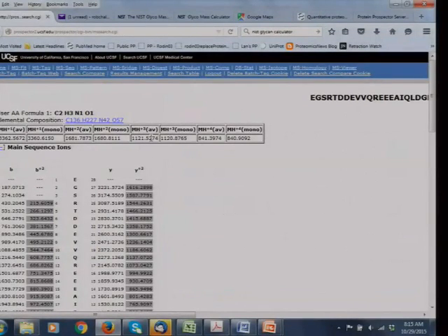It's actually the second isotope. So that peak corresponds to the intact peptide with one sugar attached. And that's what you should see for all of the glycopeptides with this particular peptide on it. So all of the different glycosylated versions of this peptide should all produce this 1121 peak, and they should all produce these low mass fragment lines.